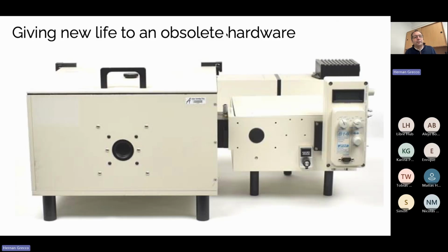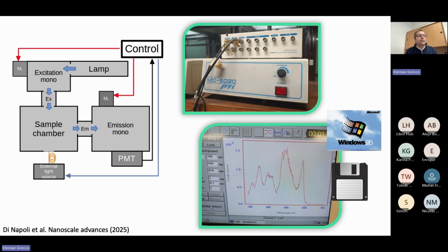And we have this spectrofluorimeter, which is a Horiba, a very nice spectrofluorimeter with an excitation arm, an emission arm, monochromators, everything. The optics is great, the mechanics is great, the detectors are great. But the problem of that device is that it's controlled with very, very old electronics using Windows 95, and the data has to be saved in a 3¼ inch disk.